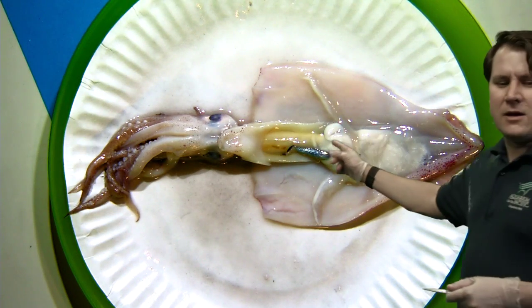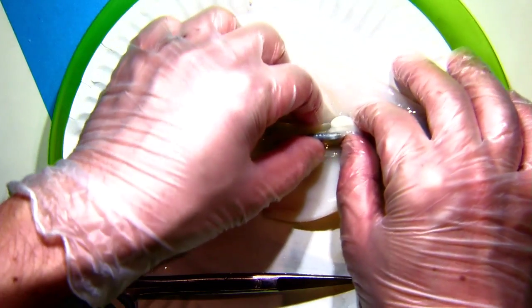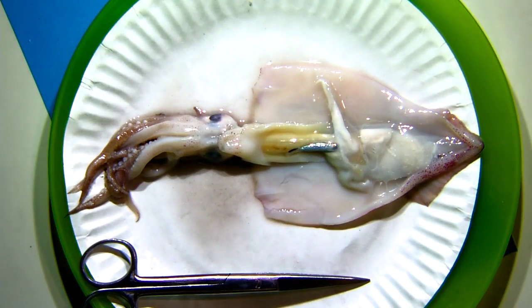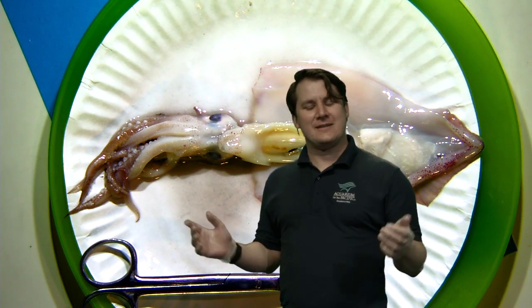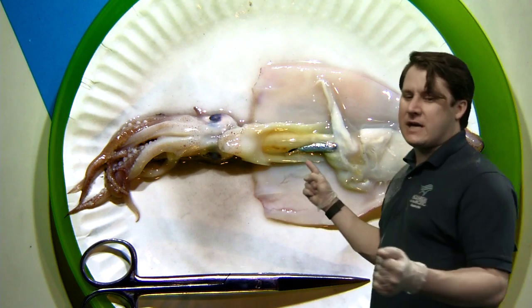If we wanted to look for the stomach of this squid, we would have to look farther up. Some of these sacs and gooey stuff lead into the digestive tract. Now I'm going to get into the really interesting parts. You're probably wondering how you know if the squid you're dissecting is a male or a female. Well, you look at this part right here. I happen to have a second squid with me, and I'm going to open that one up as well to compare. If I'm lucky, that second squid will be the other sex from this one.